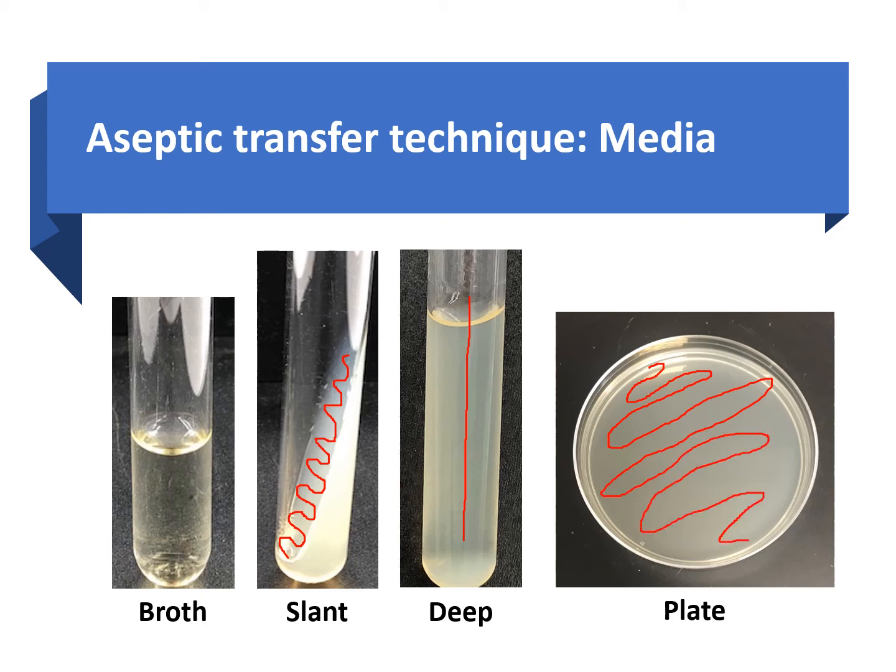Okay. I mean, this is one way of inoculating a plate. There are different ways of how you can create that zigzag pattern. We're going to talk about it later, but this is one way you create that zigzag pattern throughout your whole entire plate. Now, a broth has 0 agar. Okay, so the broth is liquid. It has 0 agar, and so it's completely liquid.